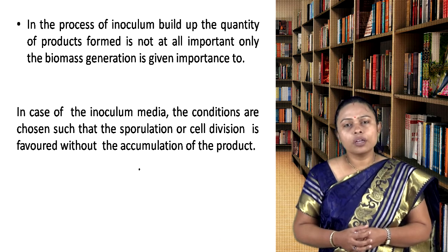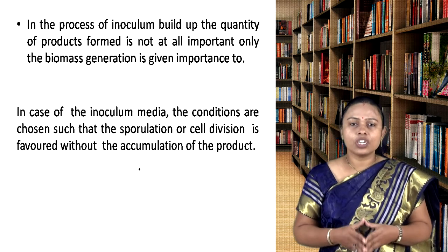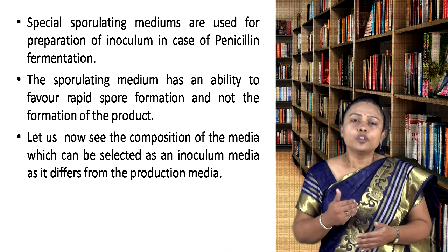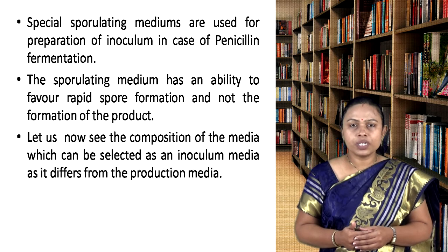In case of inoculum media, the conditions are chosen such that the sporulation or cell division is favored without the accumulation of product. Special sporulating media are used for preparation of inoculum in the case of penicillin fermentation.